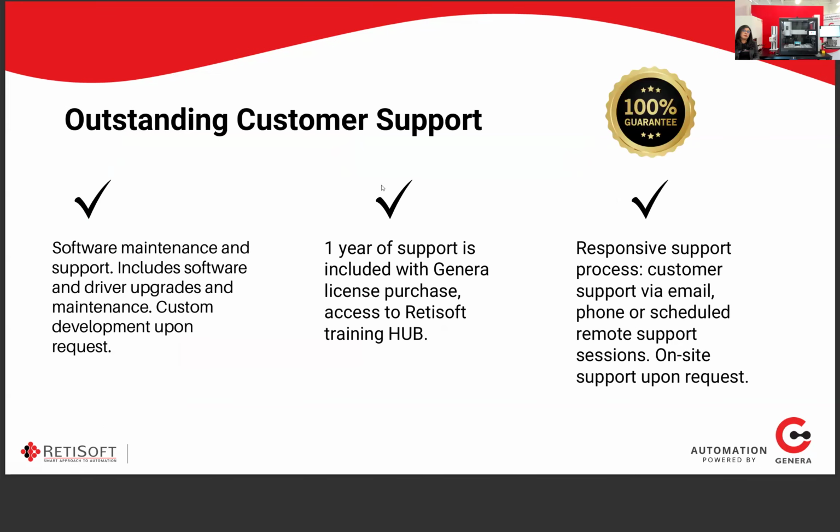Next slide. Yep, so to go a little bit into our support. With every license purchased, it comes with 1 year of support, and you have access to the Retisoft Hub, which I'll explain in the next slide. We include software maintenance and support, including any software and driver upgrades and maintenance if there's a support contract in place, and then there's custom development upon request.